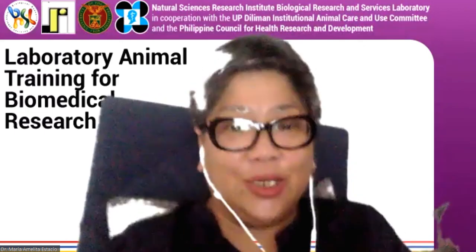Okay. I think, ma'am, I'll answer that with my next presentation. This is shorter, no? Pasensya na, the models are really more complicated to discuss. I would address that because the transgenic animals, especially for cancer, would require a more laborious or delicate management, and that would include even your caging system. If you have the conventional open cages, it would be detrimental for your animals because they are immunodeficient. So if you plan to use these immunodeficient models, you have to have individually ventilated cages, the IVCs.